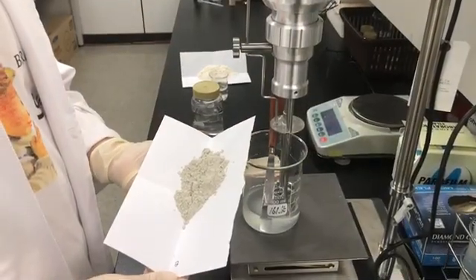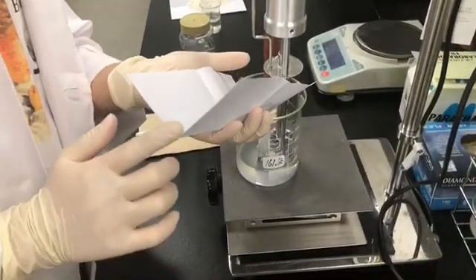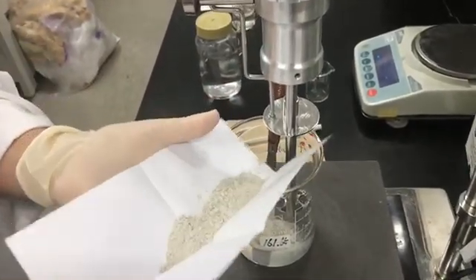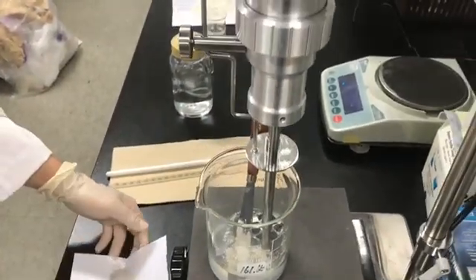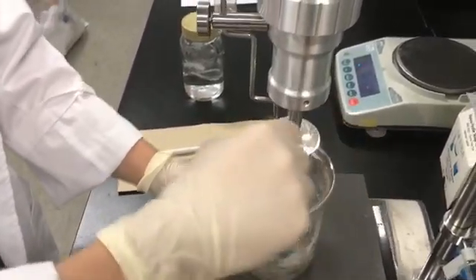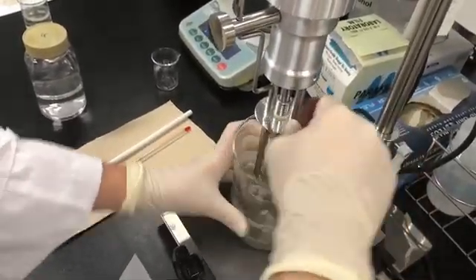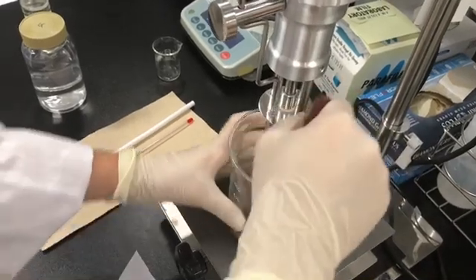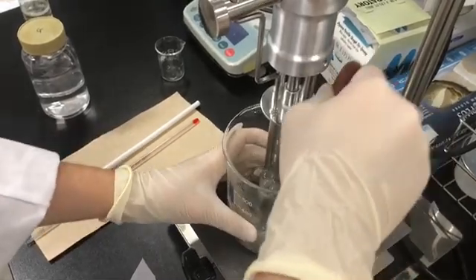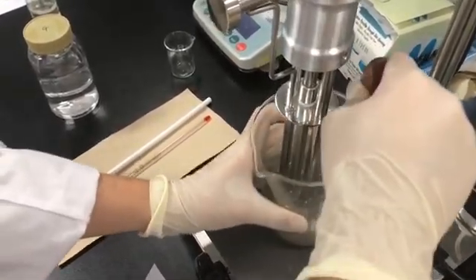Second, adding B in small quantities — we did this several times — into A plus A-1. Mixing RPM is around 2,000 rpm, then mixing for 7 minutes. If not mixed well, please mix for several more minutes.